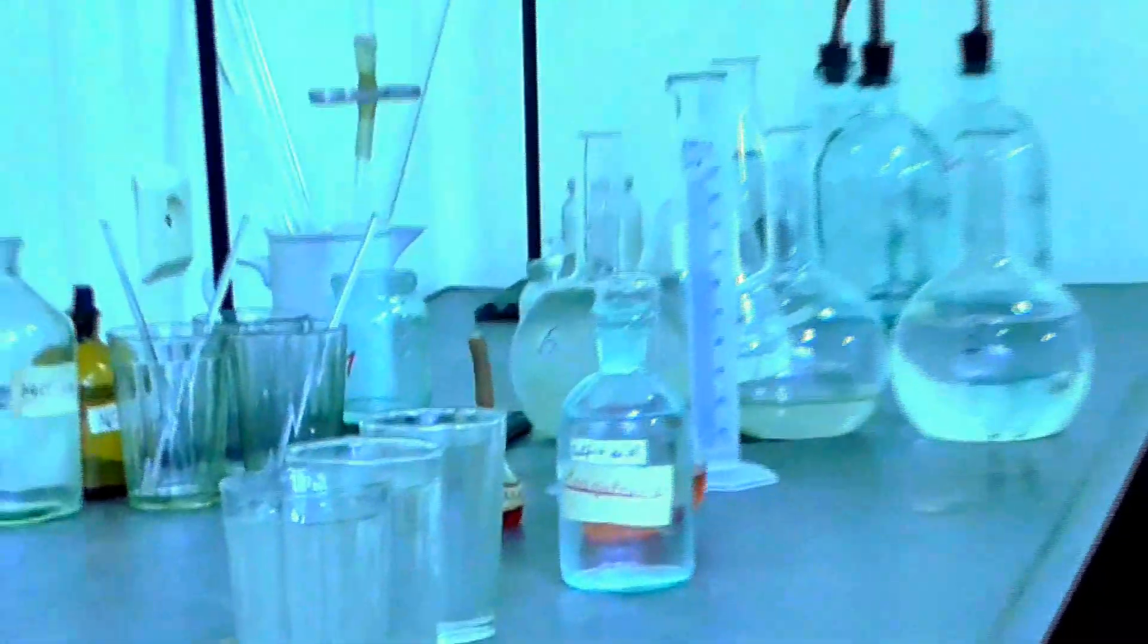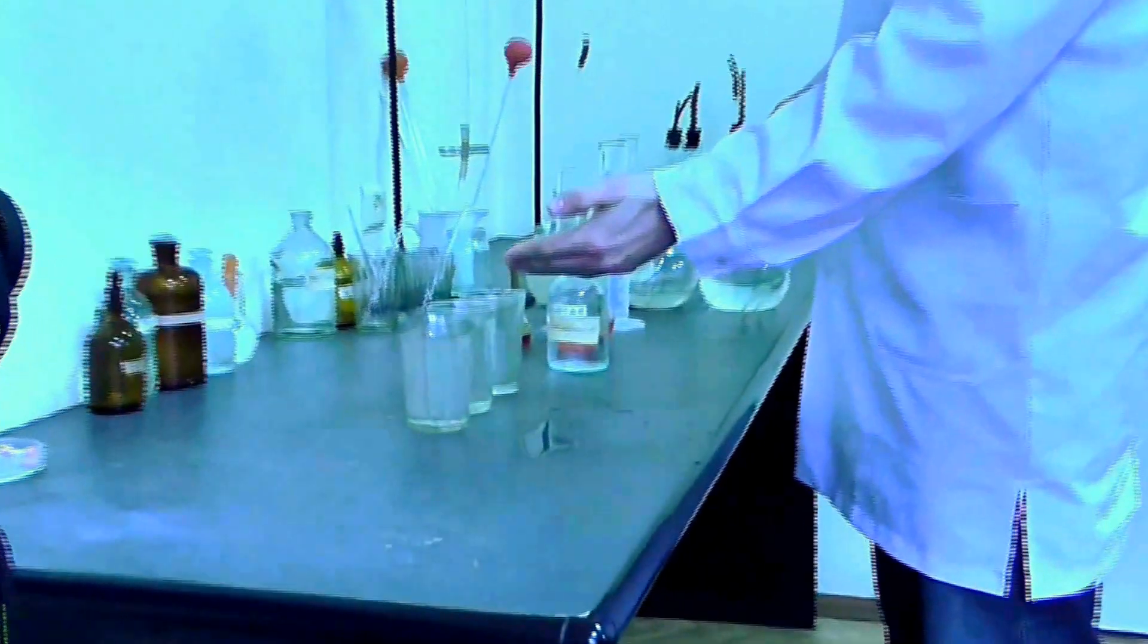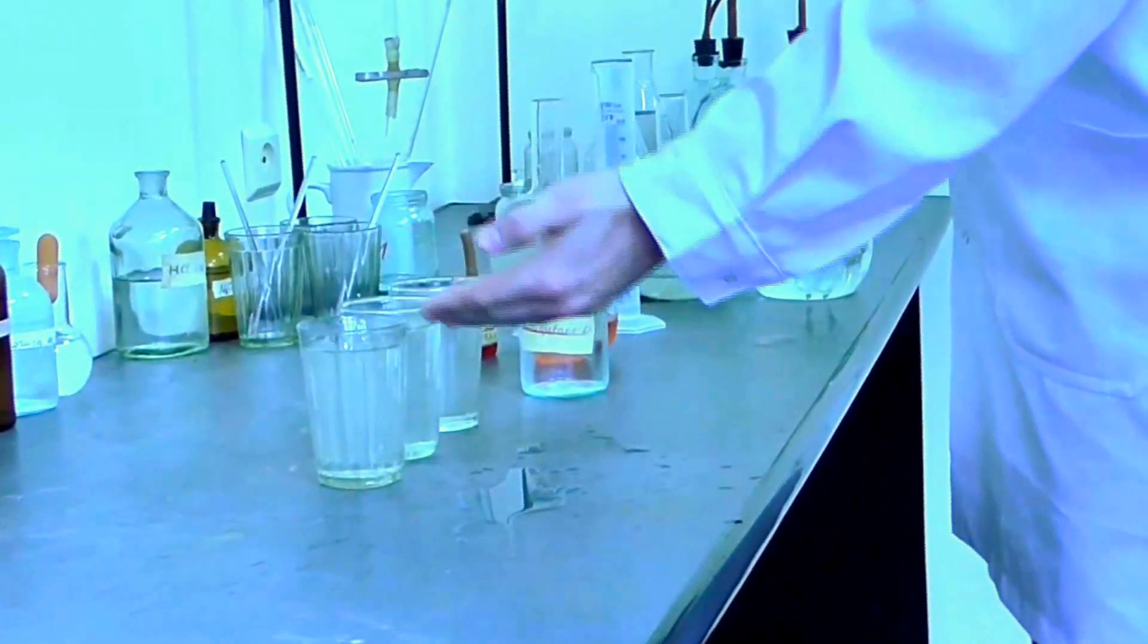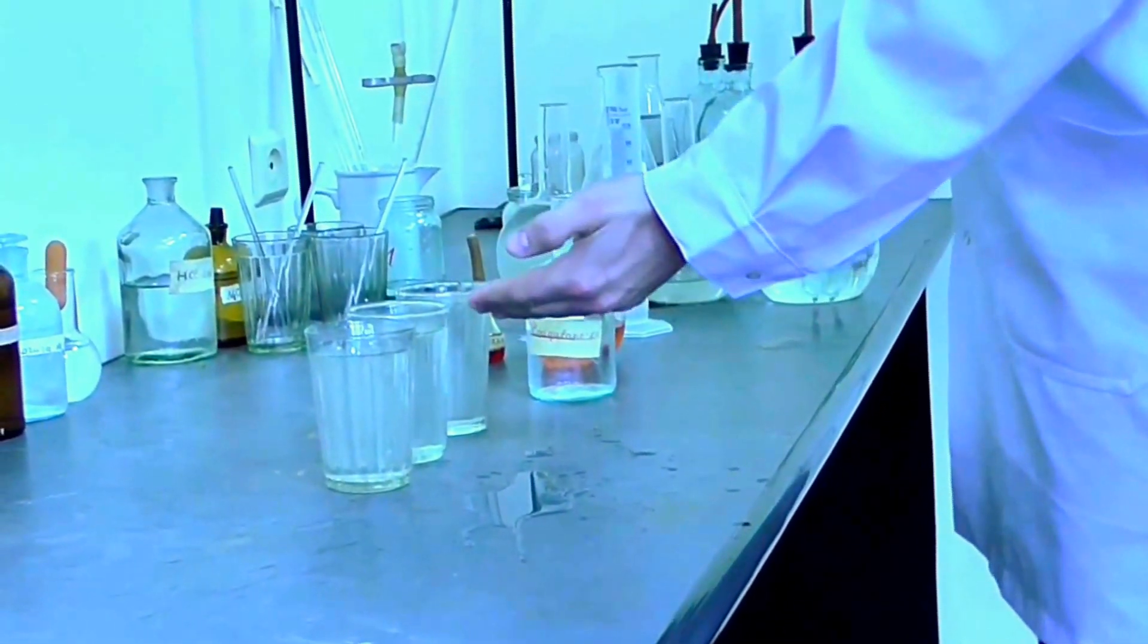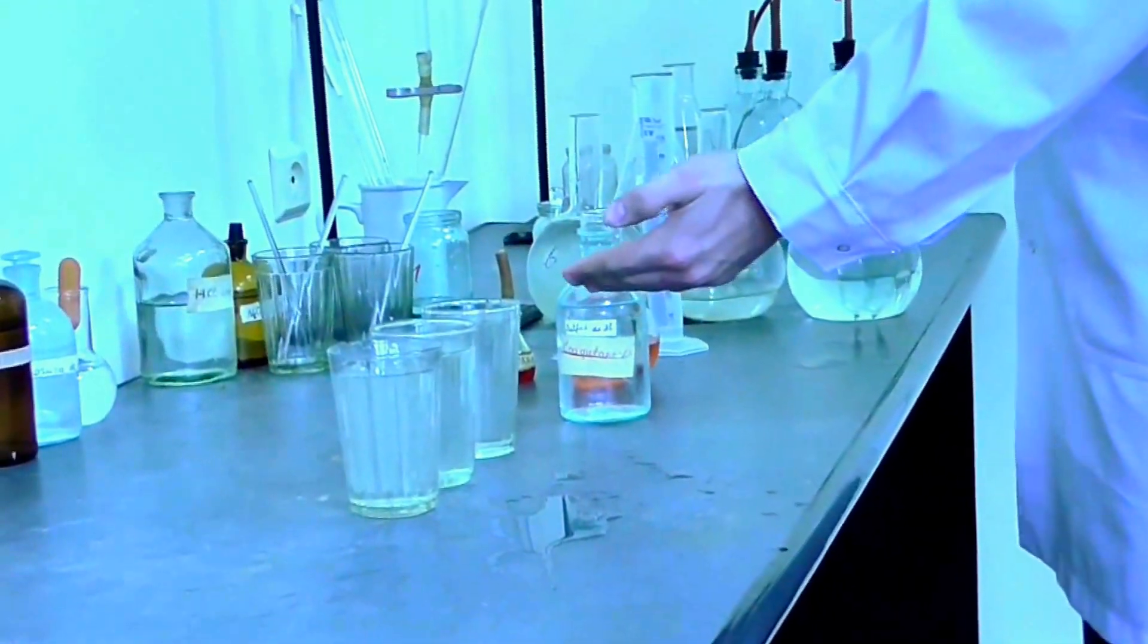Now, after determining the temporary hardness, we found that 4.5 milliliters of coagulant should be needed to purify the water. In the first cup, in order to find out which purifies better, we will put 4 milliliters, next 4.5 and 5 milliliters of coagulant.